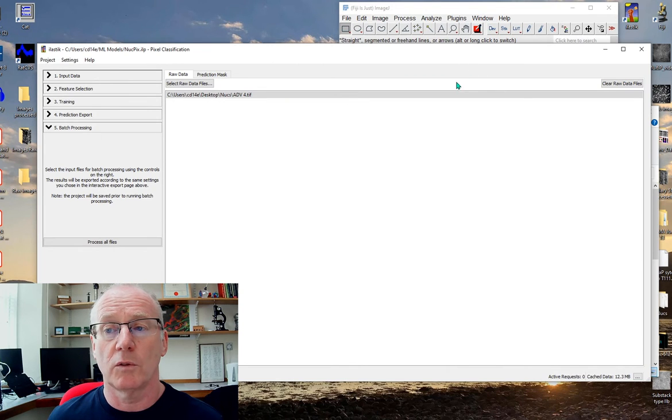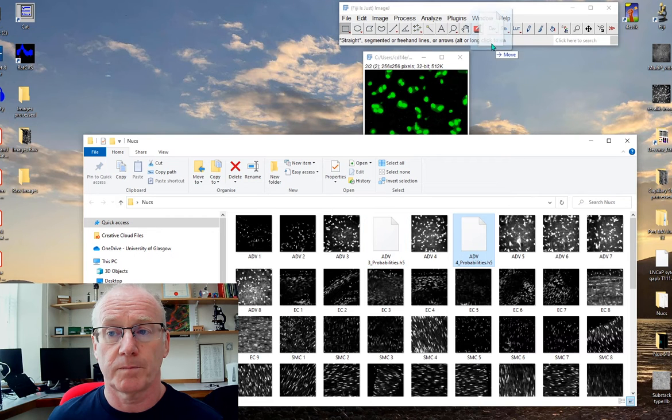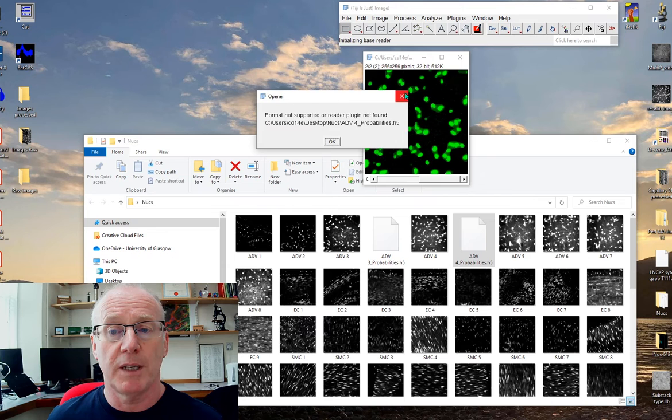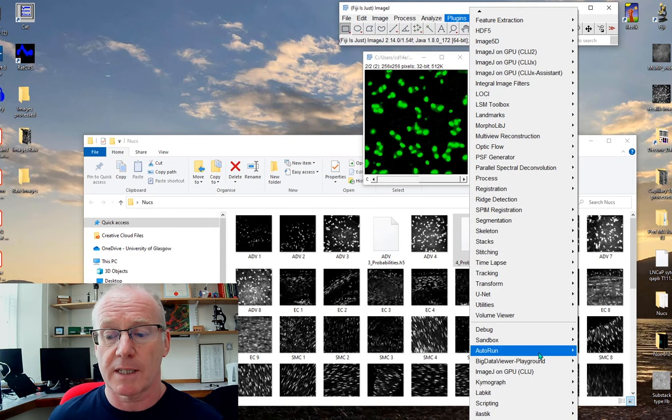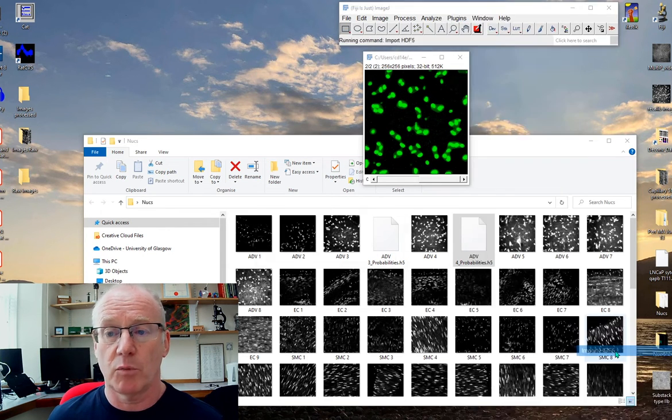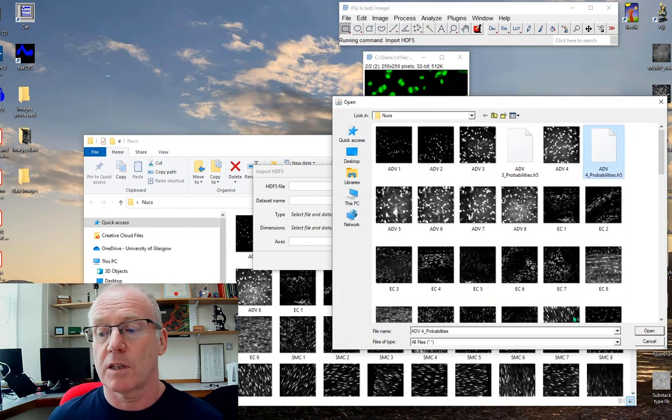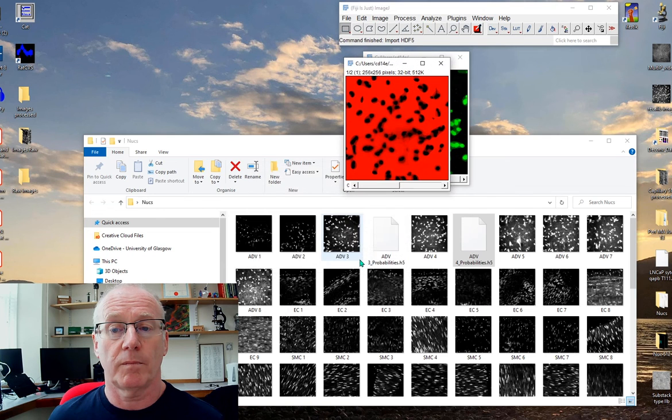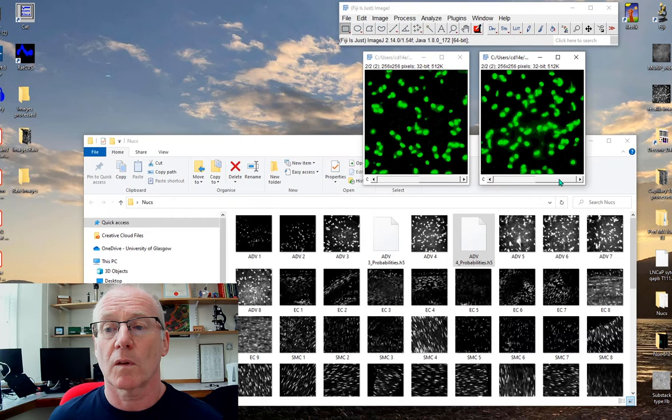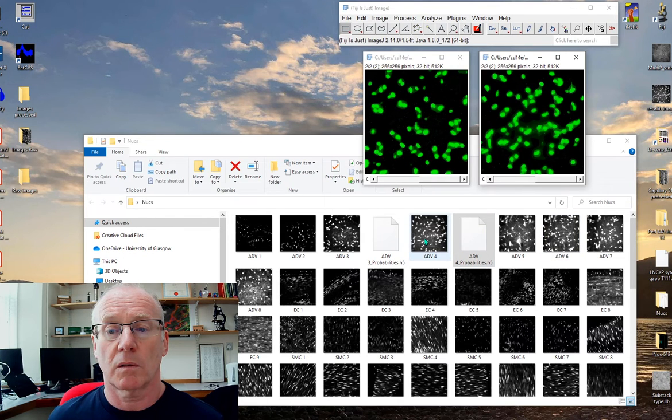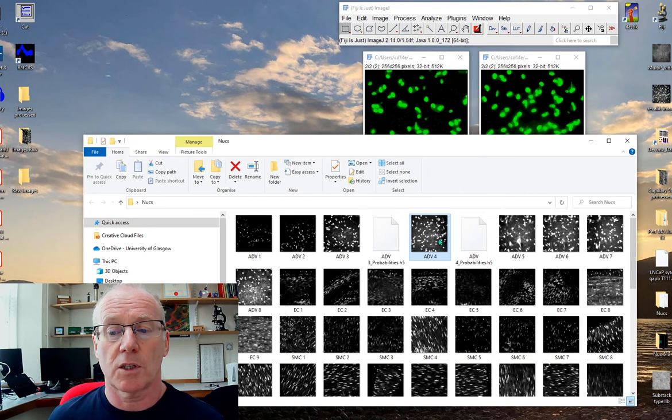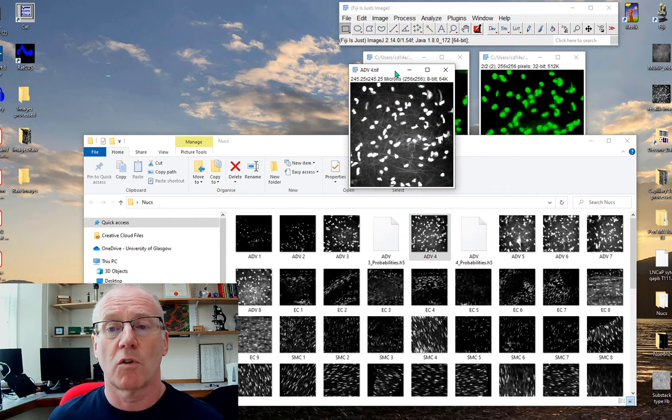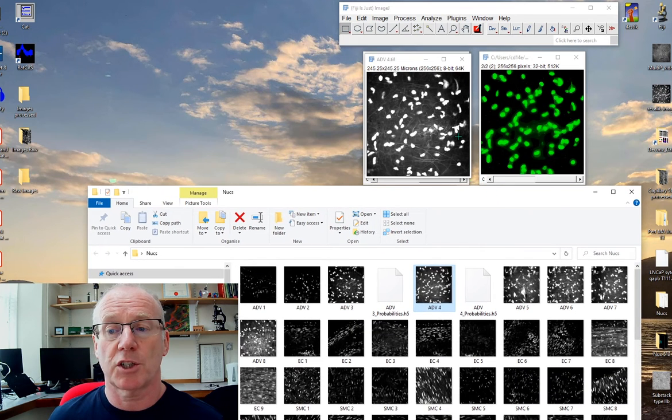If I go back to my folder, here we go. Now it's done number 4. Here's the results for number 4. It doesn't recognize that because it needs to be imported using the Ilastik plugin. We go to Ilastik, import HDF5, this is the image I want, open that up, and there's its prediction. Let's bring the raw image in. There's the raw image beside the prediction.